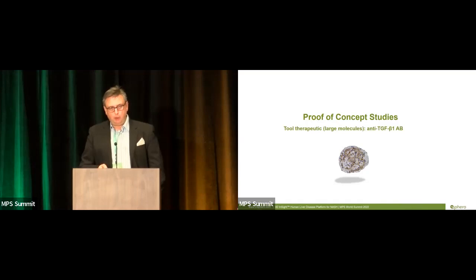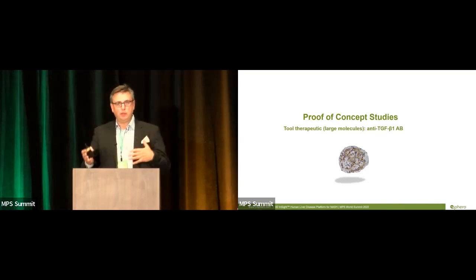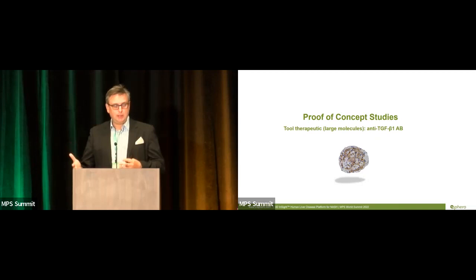Now, the important aspect is how we are quantifying fibrosis in such a context. It's not just about the amount of collagen that's deposited in the system. It's also about the structure of the fibrils, how mature they are, how strongly assembled they are. And I'll show you how we attack that in this proof of concept study.